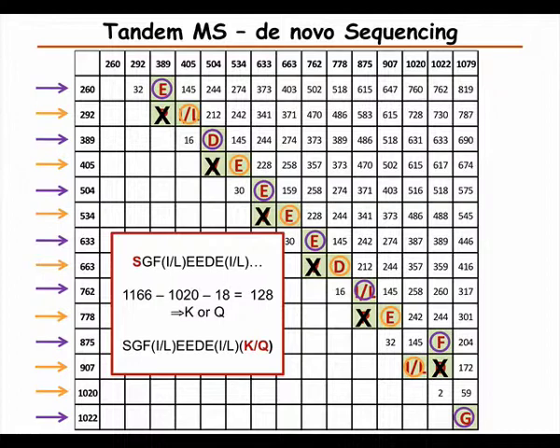So now, for very good spectra, this can be done by hand. Even for not so good spectra, you can do it as long as all the information is there. But if you can imagine, if there is missing information, it gets very complicated. You're also going to play with a few spectra afterwards, at the end, to find where they are phosphorylated.